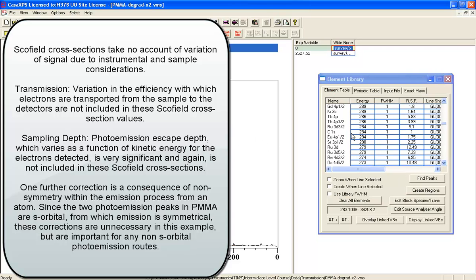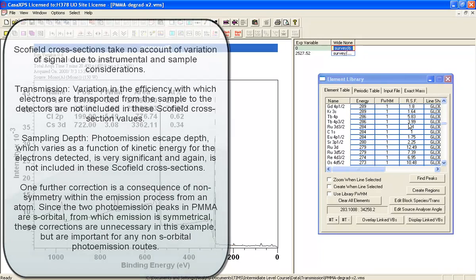Now I've got a Scofield library compiled from a set of relative transition probabilities relative to carbon 1S. You can see this is 1 here, and all these values have been calculated using Hartree calculations to work out transition probabilities. These have no knowledge about the instrument at all.